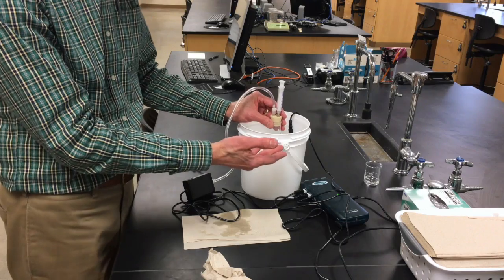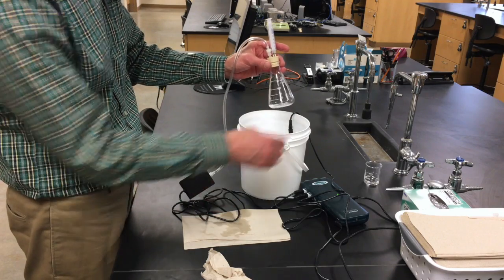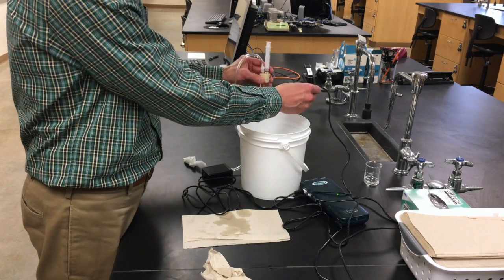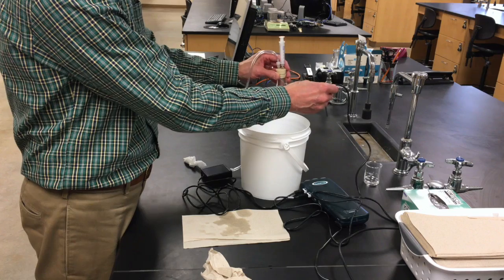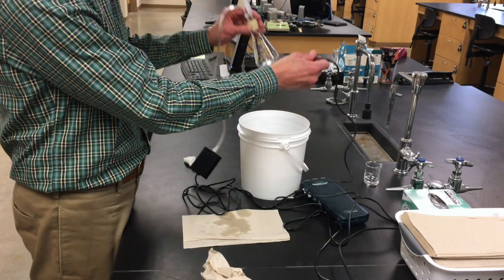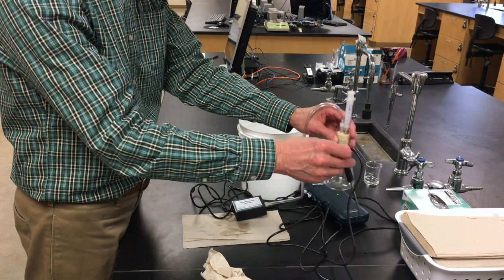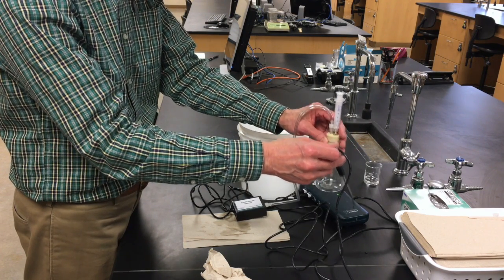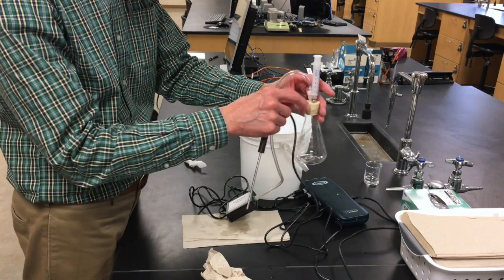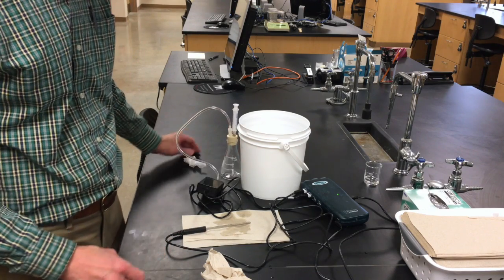And then when you go to the other baths, don't change a thing about this. All you have to do is pick up the flask and the temperature probe and move them to the next water bath and wiggle it around in the next bath and wait for the pressure and temperature to stabilize. And when that's done, again, just pick these up, move them to the third temperature bath, wiggle them around, wait for the pressure and temperature to stabilize. And don't change a thing. Don't mess with the syringe. Don't play with that. Just pick it up and move it. That's it. Have fun and get good data.